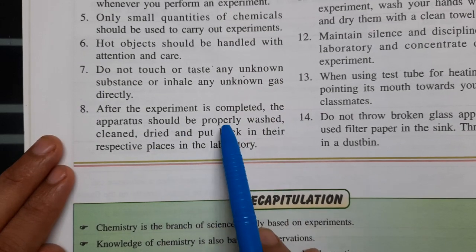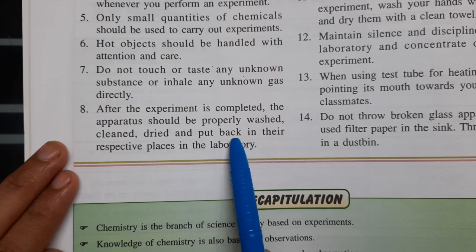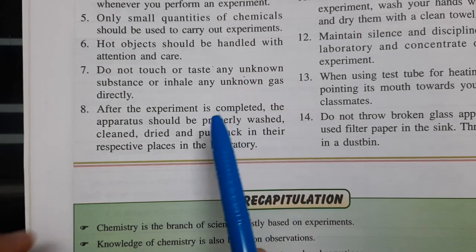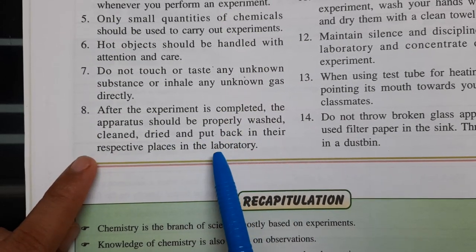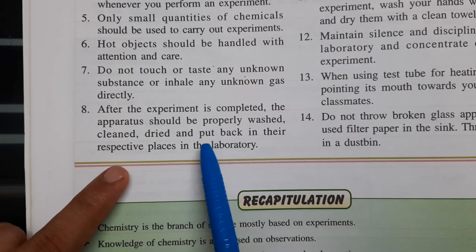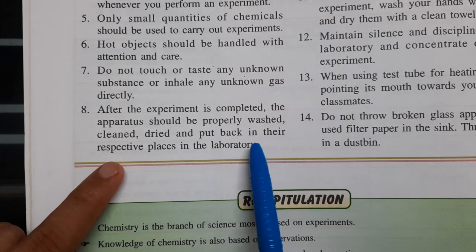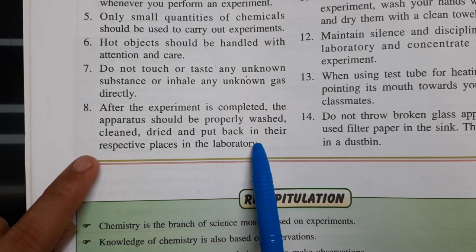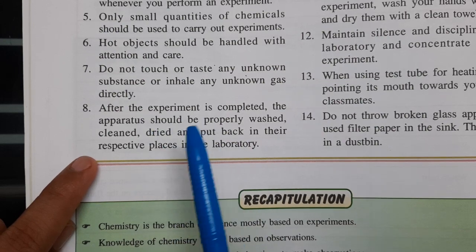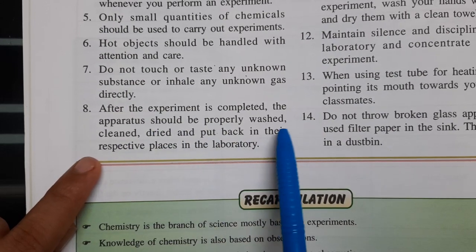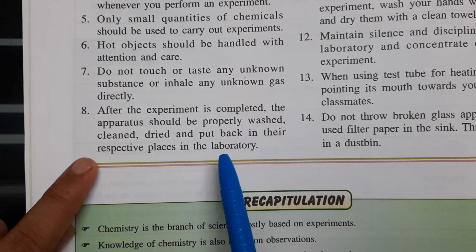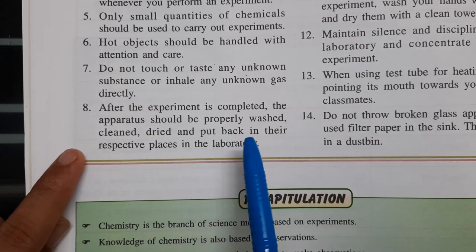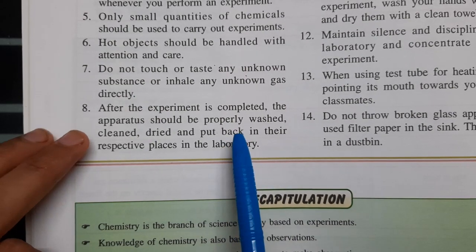Next: after the experiment is completed, the apparatus should be properly washed, cleaned, dried, and put back in their respective place in the laboratory. After finishing your experiment, wash and clean all apparatus and arrange them properly in their designated places. For example, reagent bottles should go back on the reagent shelf, and all other apparatus should be returned to their specific places.